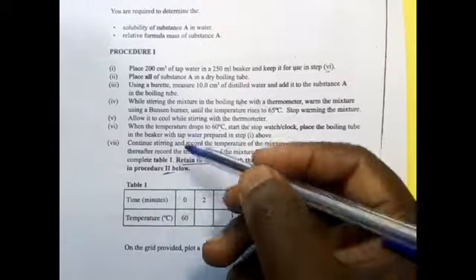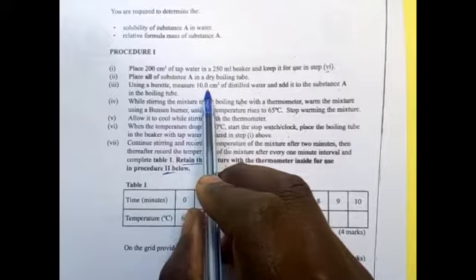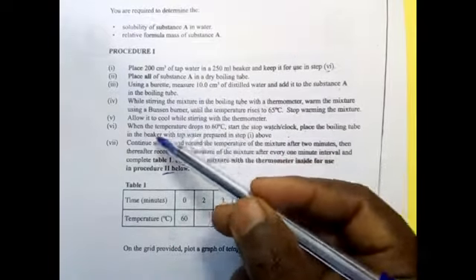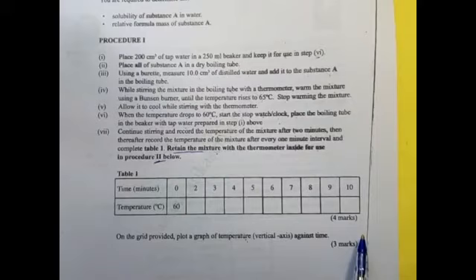So I want us to understand here. What did we do? We took solid A, put it in 10 centimeters cube of water, and it is dissolving using the temperature here. I want to give you the values so that you can draw that graph at home.